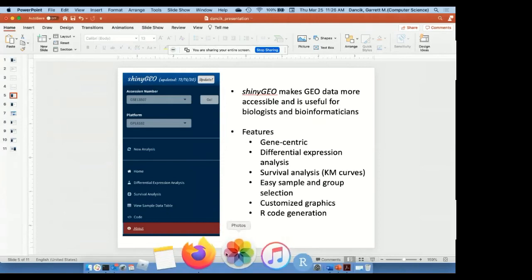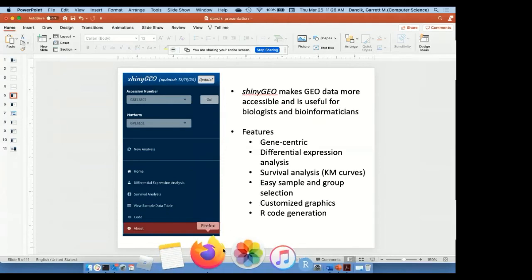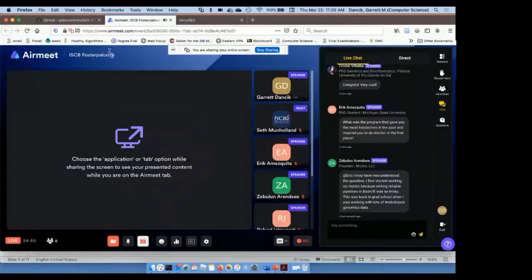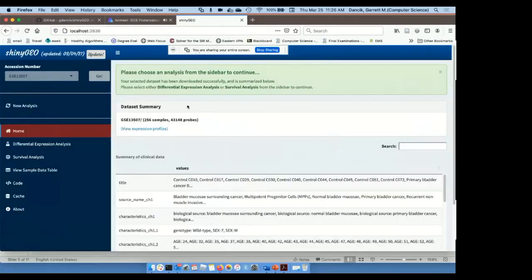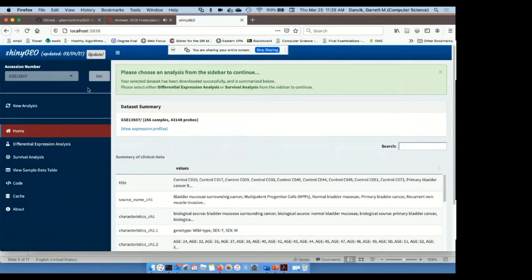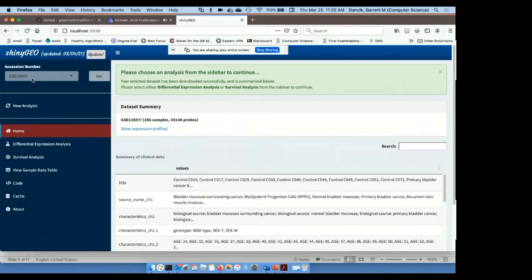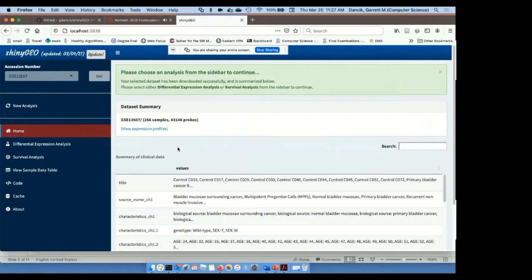I'm going to switch over to the tool itself and give a very brief demo of how this works. What I'm going to do is use this tool to analyze a bladder cancer gene expression dataset, which has the ID GSE13507. Because it takes a little bit of time to download the data, I've already done that, and so what we're looking at is the home page after that data has been downloaded.